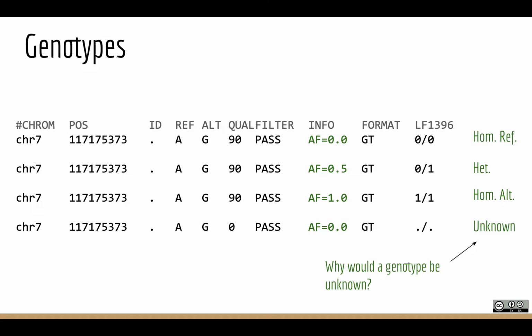Oh man, Sarah. Microduplication. Tell me what that is. Well, what if just a portion of the gene duplicated, and so now they've got essentially 3 copies. Same thing. If there was an alternate allele present in that second duplication, and it's not just increased depth, then it would just report it as an extra alternate allele. If the part of the genome is duplicated but there's no unique nucleotide within that duplication, it's just going to look like increased coverage for that individual. You'd have to use a specialized variant caller or a copy number variant caller, which we'll talk about later. Good question.